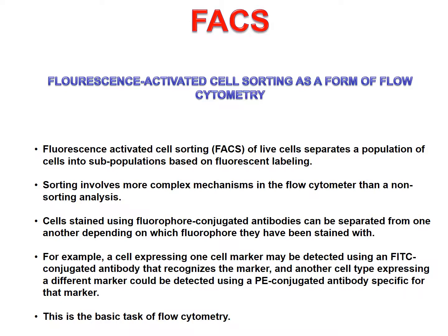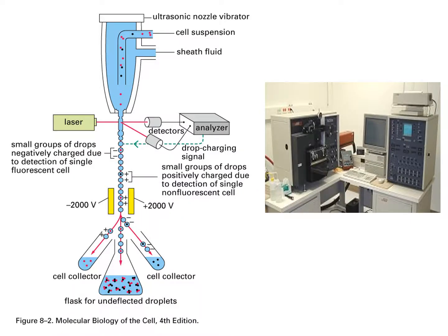These cells can then be cell cultured, grown up, frozen, studied, etc. at that point. So there are other experiments, again, under diseases, different organs, different conditions, one is able to study. Again, you have a population of cells. On the right is the typical machine. It's a little out of date there. That screen looks ancient.